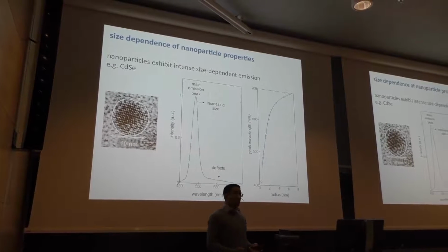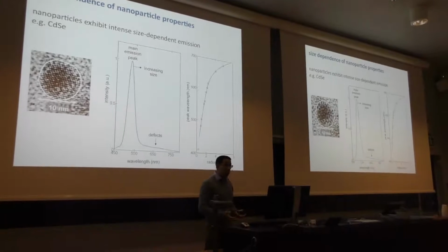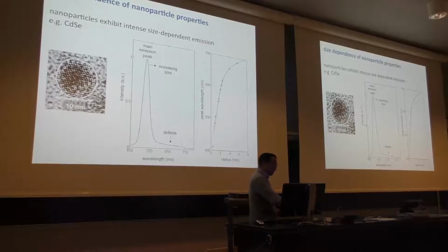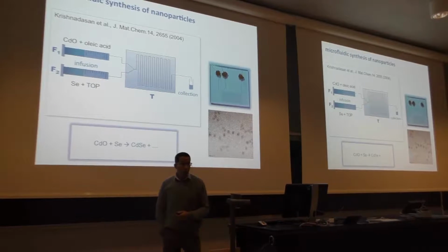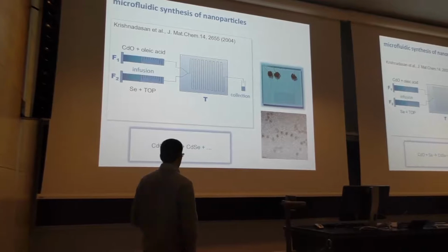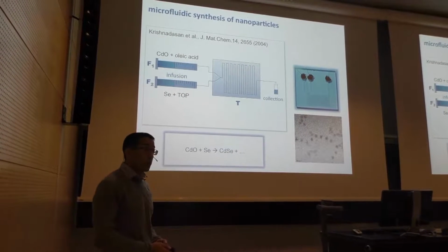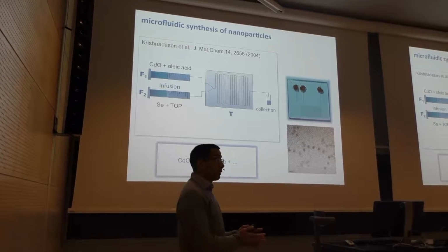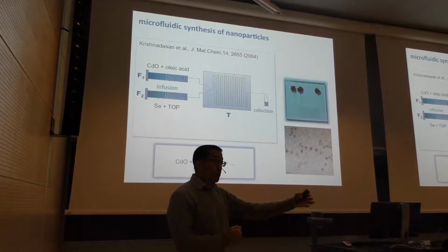So this is a very nice system for evaluating flow chemistry, because we can make quantum dots in our flow reactors and we can analyze them spectroscopically, and from that we can tell how much control we have over the reactions we're carrying out. And so, as I say, we normally work with very simple chemical systems. So pretty much everything I'm going to describe today involves mixing 2 or 3 reagents together and perhaps simply heating them.